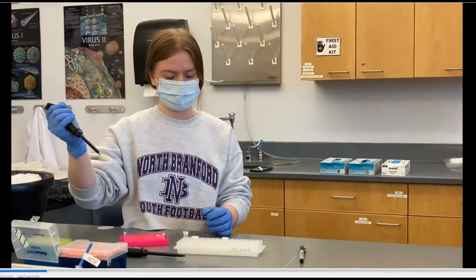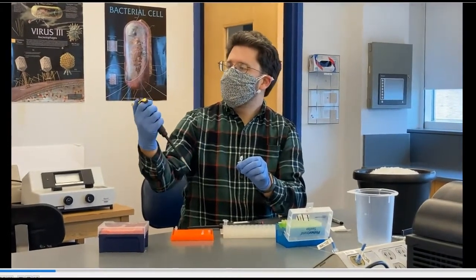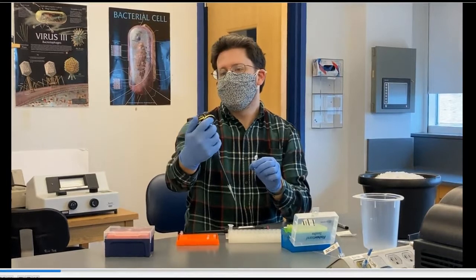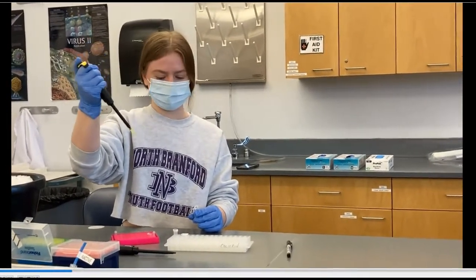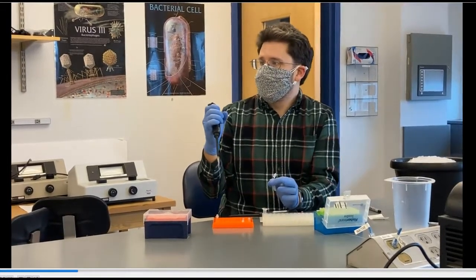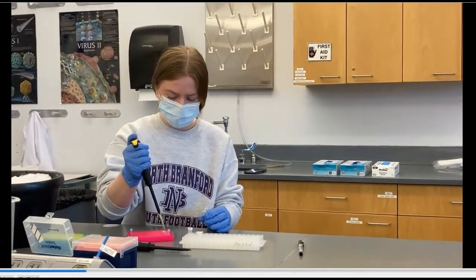Take the water tube and open it up. We're going to draw up 22 microliters. Press down to the first stop, feel a little bit of resistance — if you push again that's how you eject it. So go down to the first stop, stick your tip into the water, and then pull up. That should be 22 microliters of water. Then go into the first tube and press all the way down — that should release all the water into that tube. Then repeat that for the second tube.